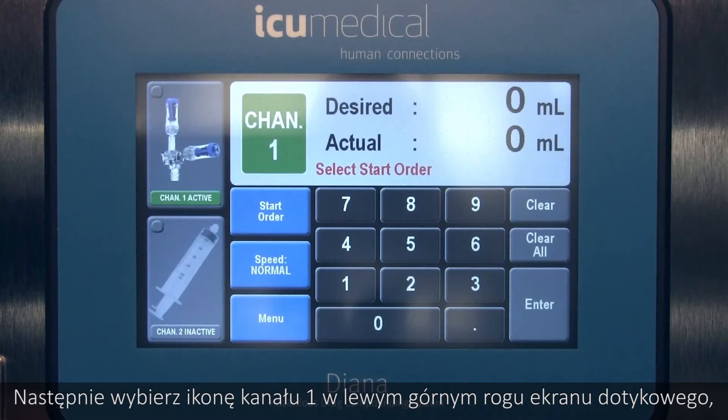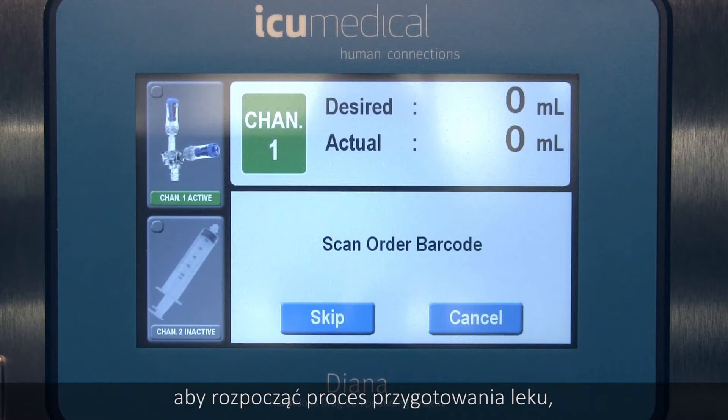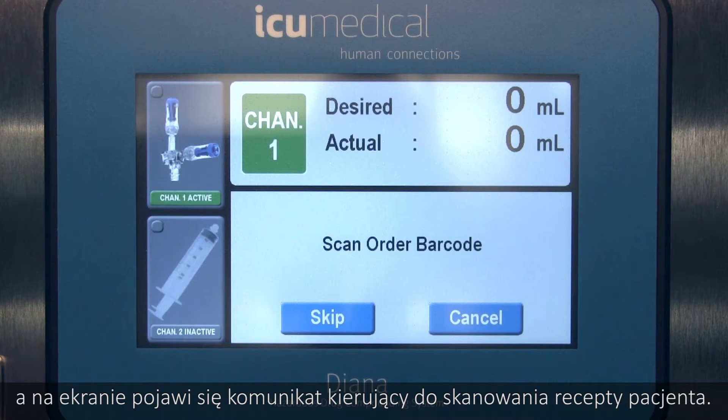Next, select the channel 1 icon in the upper left of the touchscreen display. Then touch Start Order to begin the compounding process, and a prompt will come up on the screen directing you to scan the patient order.